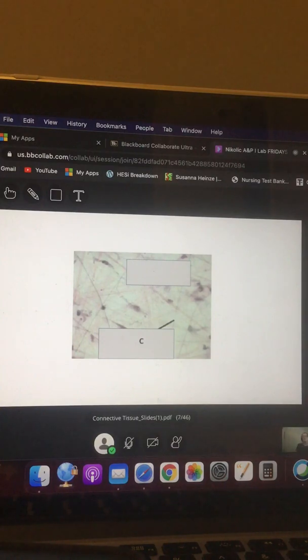What's this? I like this. The other one I didn't like. I just thought that's a bad example. What's this? Elastic fiber. I mean, this is a good example. Elastic fiber. Yeah, I just think the other ones are very, very small for collagen, and they could have chosen a better one. But whatever. All right, awesome. Good job.